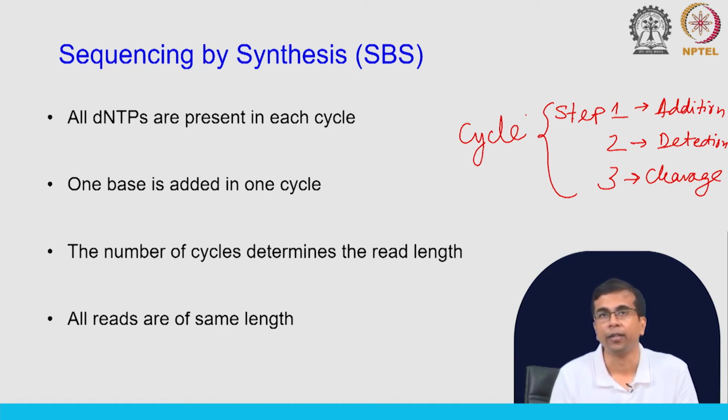In Illumina it is typically 150, 200 or 250 at most. You can control between 50 to 150 to 250. So, you can decide, okay, we will stop this after let us say 150 cycles. Depending on the machine that you are using, some machines can handle 250 cycles, some machines will give only 150 cycles.